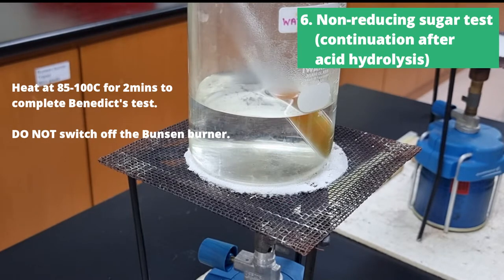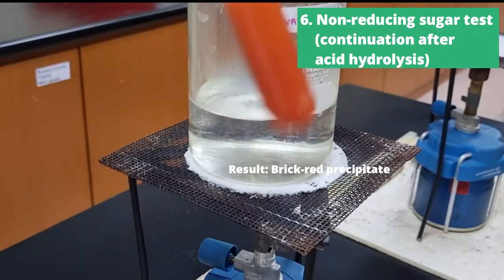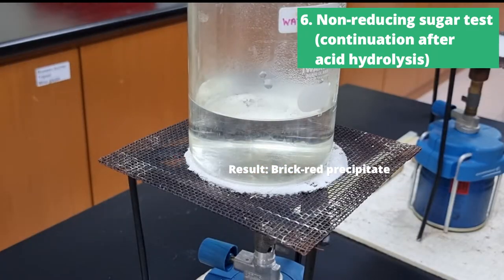Now you will see the solution in the test tube go from blue to brick red. This is because after acid hydrolysis, the non-reducing sugar has been broken down into monosaccharides, and all monosaccharides are considered reducing sugars and therefore will test positive with Benedict's test.